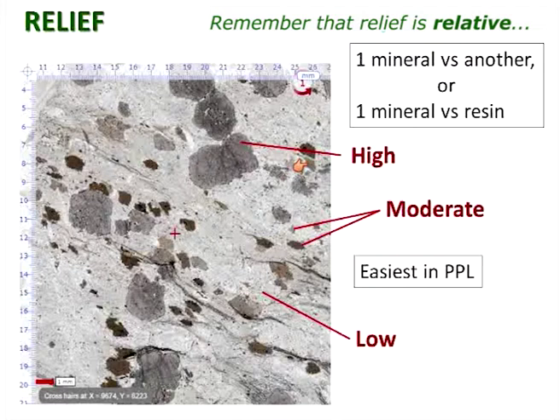You probably know that that is biotite, a very common mineral. But even if you didn't know what those two minerals were, you could see that there were two different types of porphyroblasts, two different types of mineral in that section. And having that kind of perspective early on is very useful for mineral identification, because it means you're not looking at every tiny grain and trying to identify it just on the properties of that one grain and then moving on to the next.